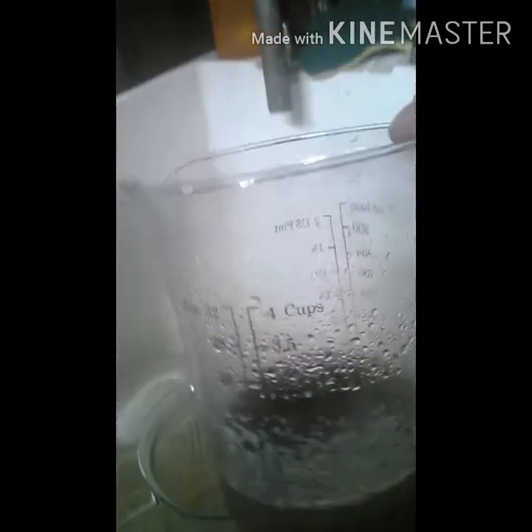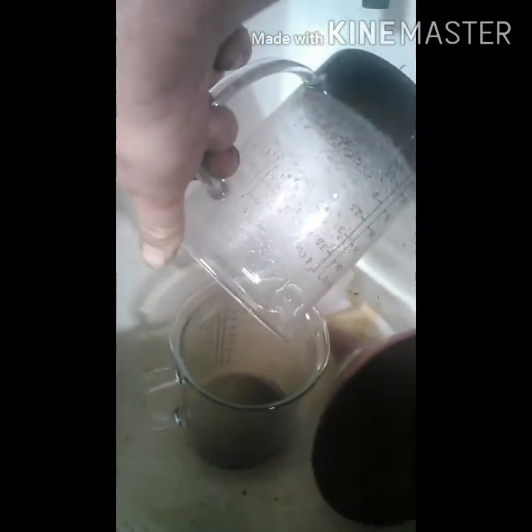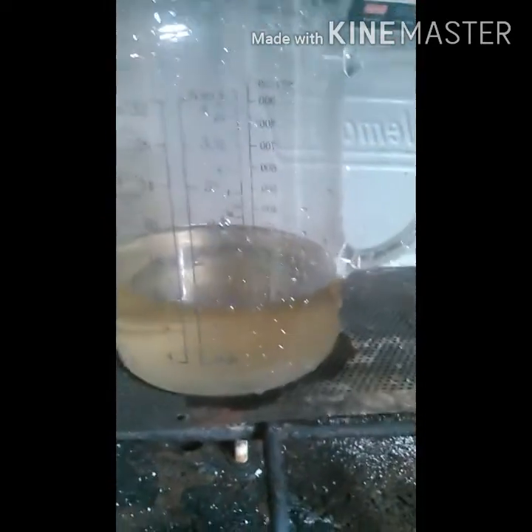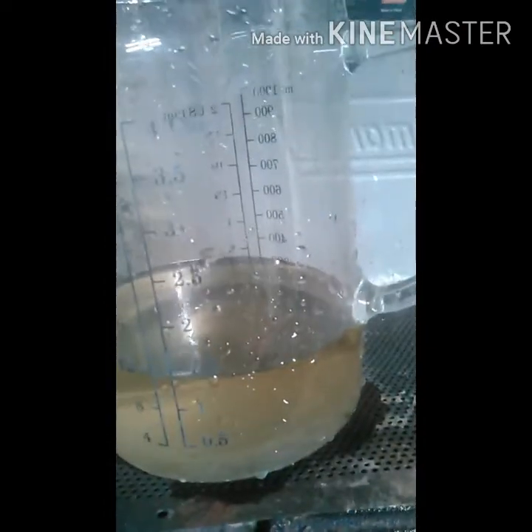It's all crystallized. I'm going to pour off what's come out and add some more fresh water, then dissolve it again, heat it, and do the same process again. It's re-dissolved and I've filtered it twice. Now I'm going to boil off my water again, then cool it to re-crystallize it — the whole thing again.